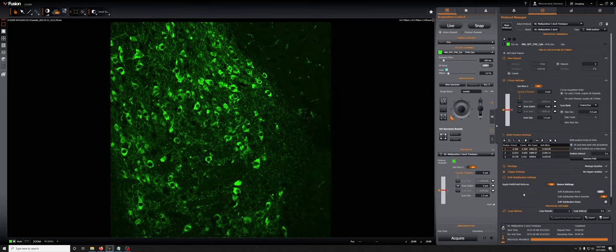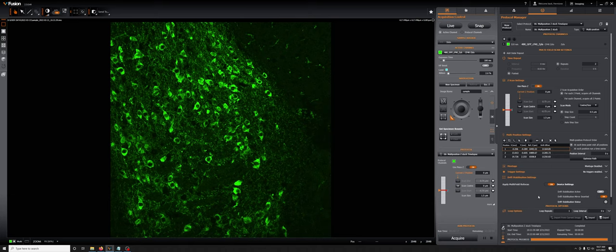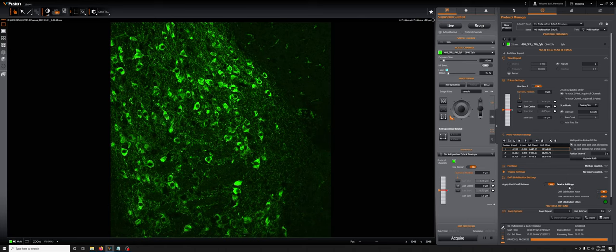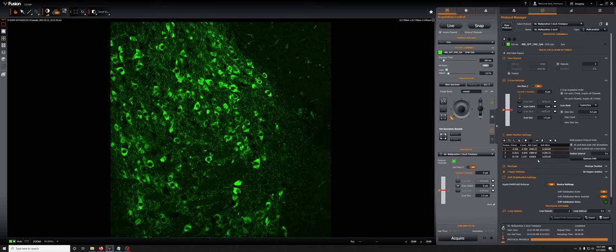Once you've added all of the positions to the list, the final step is to ensure that drift stabilization active is turned to on. Once the drift stabilization is active, and you can see that by this green light, if you hit acquire, the experiment will run in its entirety. At each position, it will compensate for any drifts.